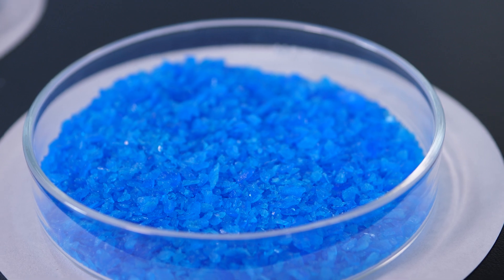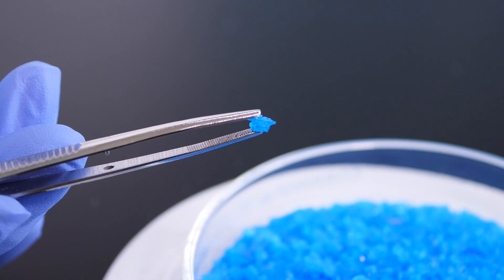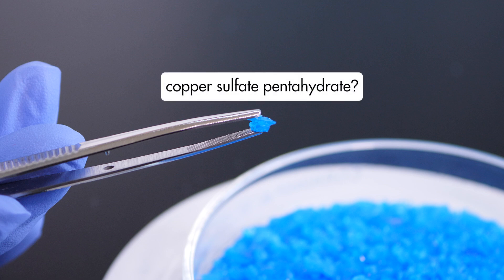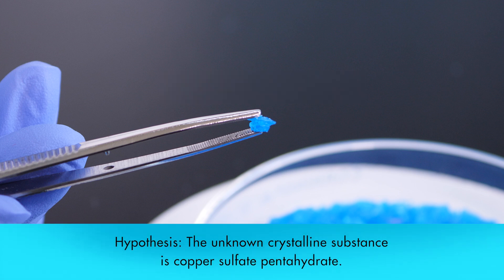During our research, experimentation, and observation, we found that the physical properties, such as color, solubility, pH, and density, of our unknown substance, closely match the properties of copper sulfate pentahydrate. Therefore, we can make our hypothesis, which is, the unknown crystalline substance is copper sulfate pentahydrate.